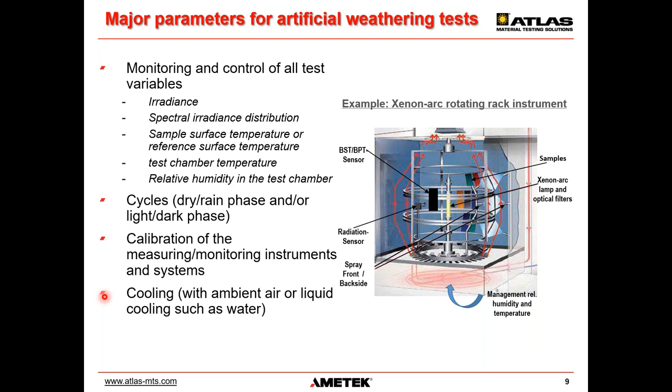So you can do some cycling with additional chillers, or you simply have thermal sensitive materials which would melt or degrade too fast through thermal effects alone. Then you also add a chiller. The cosmetic and the pharmaceutical industry, for example, typically add a chiller to simply study the photostability effect and exclude or minimize the thermal effect.